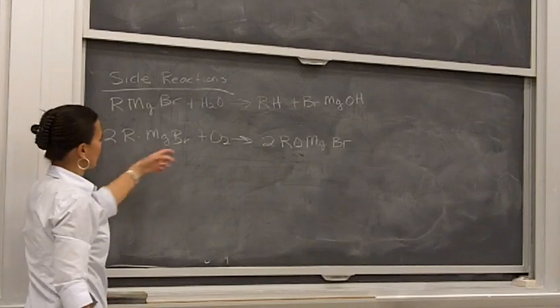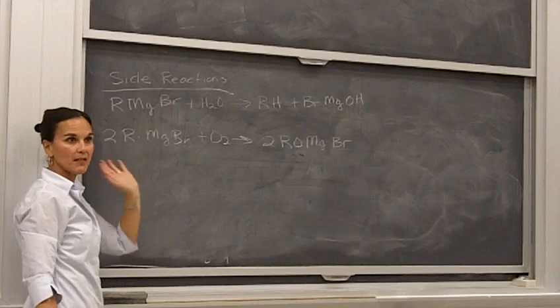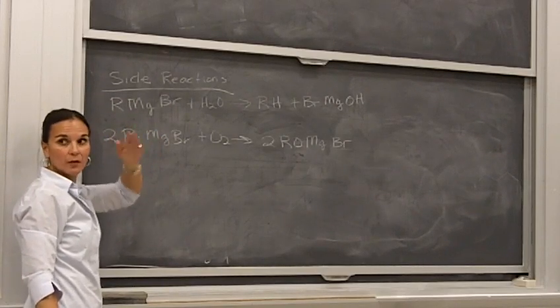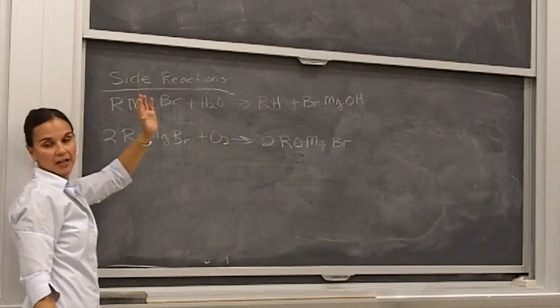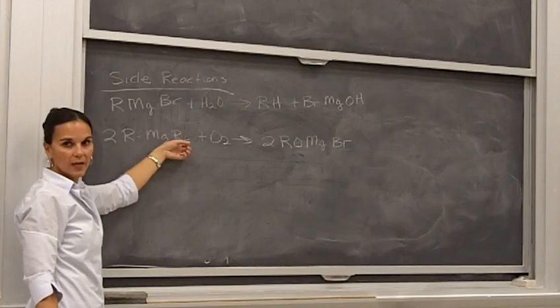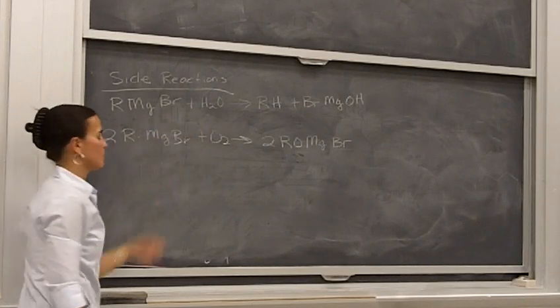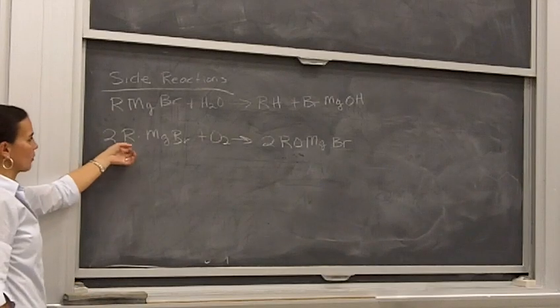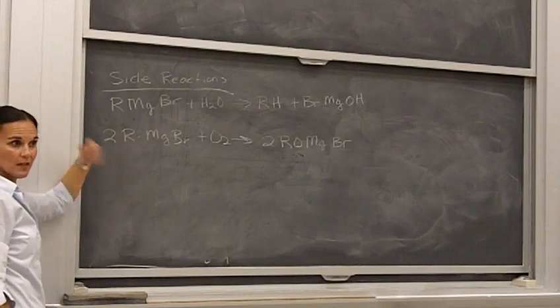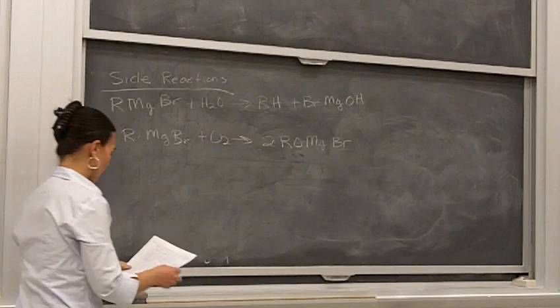So what we're going to do here is we've got the ether that has a high volatility, so that means that it's going to have a lot of ether vapor sitting above the liquid to kind of keep the oxygen out of the reaction. And then we also use cotton balls in any openings that we have in our setup so that we keep that exchange of oxygen to a minimum. The other part is when we're making our Grignard reagent, we're not going to stir the reaction because we don't want to stir oxygen into the reaction, okay?